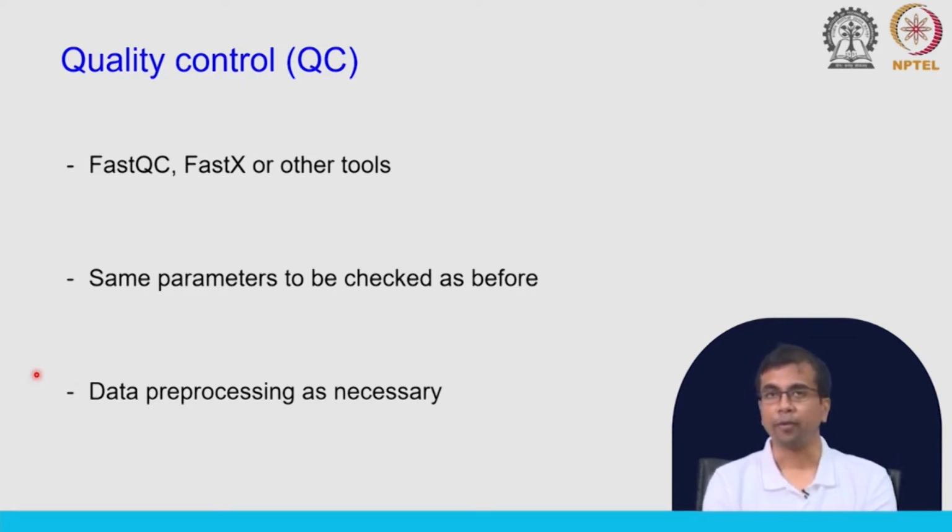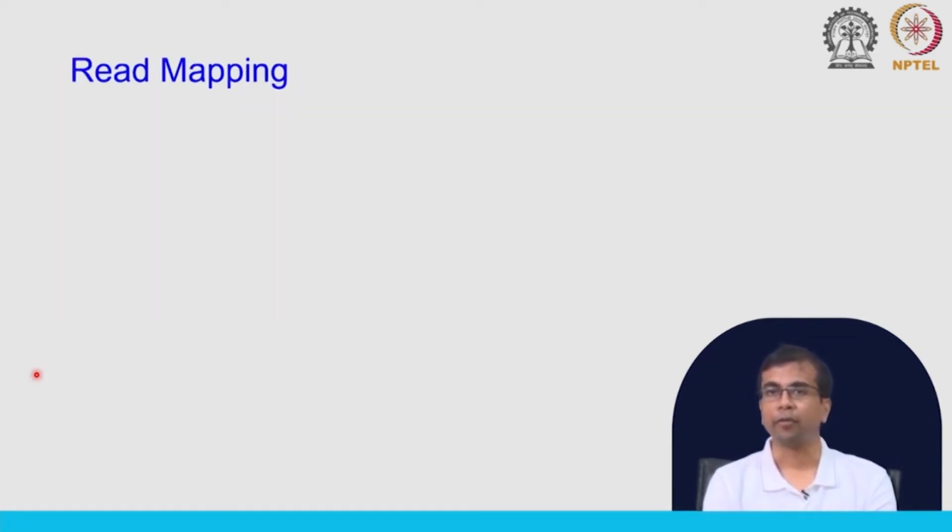So, what I am going to do is discuss read mapping. Why is this a problem here, what is new here? We have talked about read mapping, we have talked about the tool Bowtie2, and we have utilized that tool for read mapping in a small data set. If you remember, Bowtie2 relies on the Burrows-Wheeler transformation, is very efficient, and does not take too much memory. So, what is the problem? Why can't we use just Bowtie2 here?